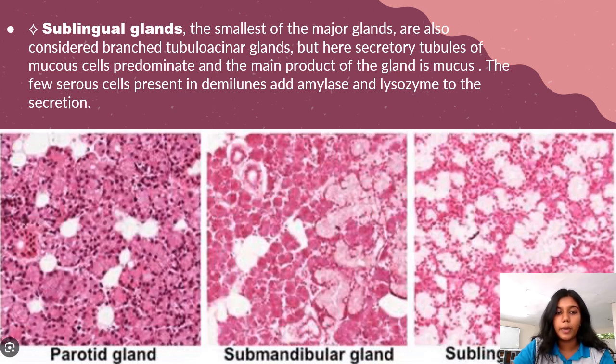So these are the pictures for the parotid gland, the submandibular gland and the sublingual gland.